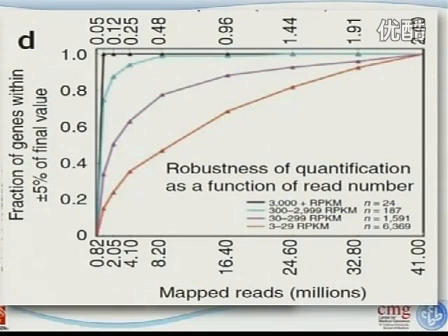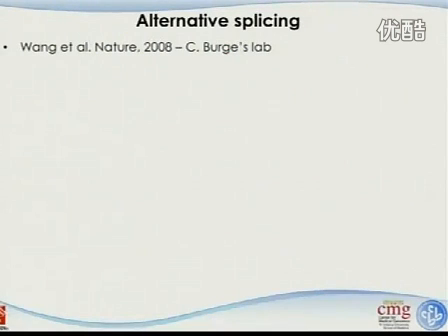And if we talk about 3 to 30 RPKM, this is the performance. So the point here is the deeper the sequencing is, the more accurate your result will be. But keep in mind, 3 RPKM is already a pretty big number. Based on this type of measurement, if you think deeper and play with the real data, you can estimate how accurate your final result is.